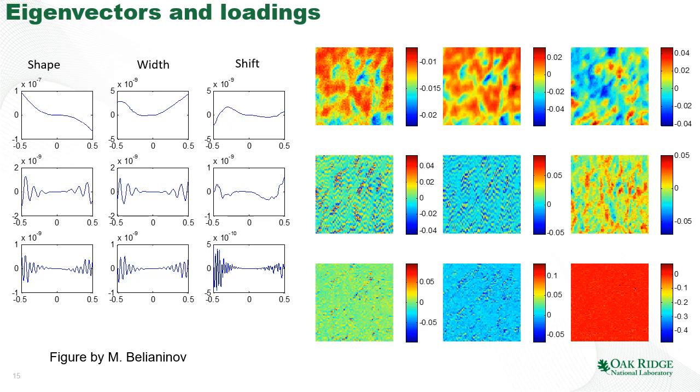What is interesting is that once you look at the first, second, and third components, you can clearly see topographical features. In other words, they are not random. There are multiple atoms that participate in the formation of these collective features. So we actually learned something about the electronic structure of the material. We don't know exactly what it is, but we know that it is real.